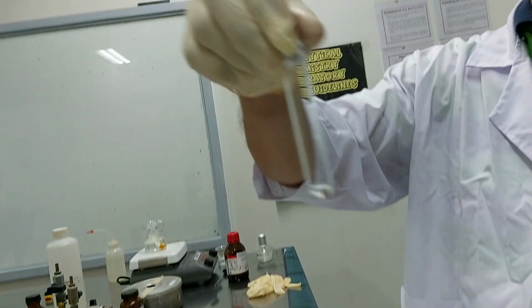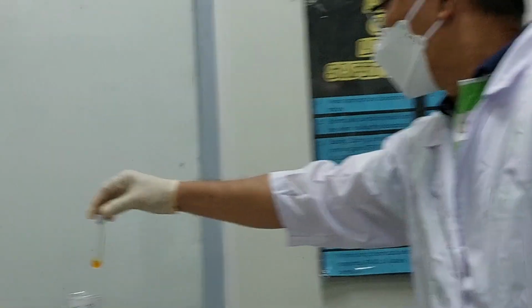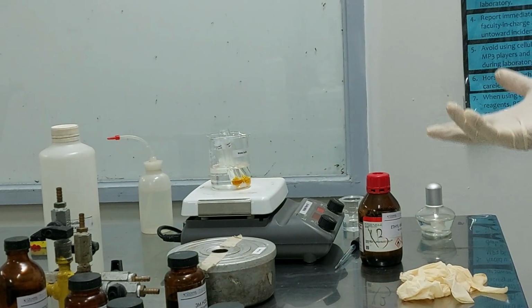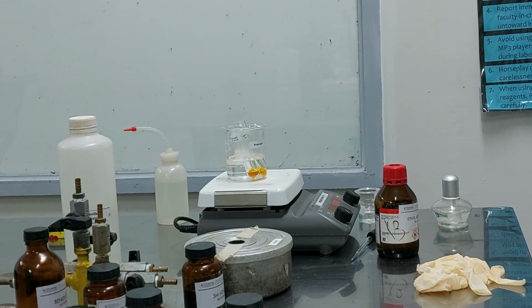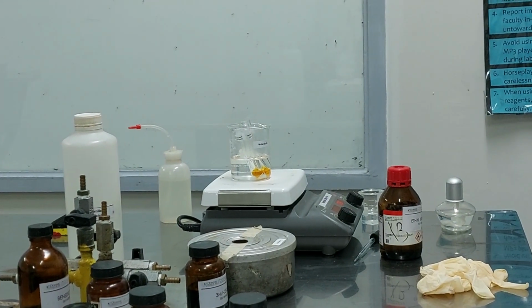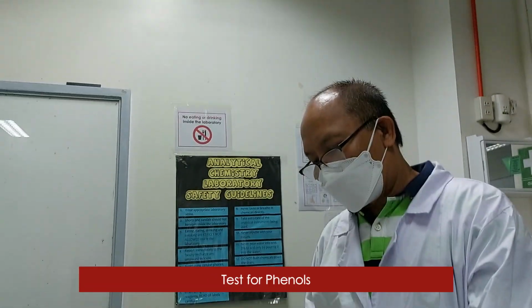Now we have ethanol to represent primary alcohol. Shake, shake. So this is our primary. Let's see after 5 minutes. If the color changes to green, that means your chromium +6 has been reduced to chromium +3 and your alcohol has been oxidized. While waiting for that, we can move on to the next experiment.